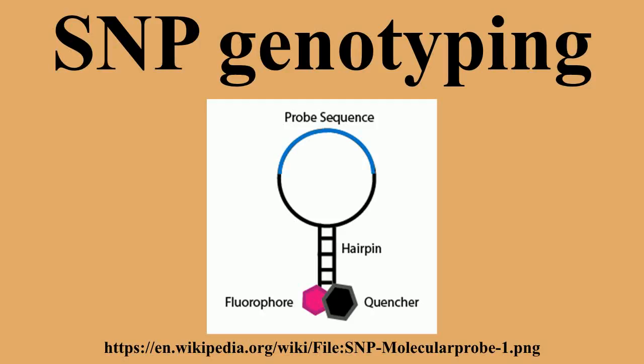If the allele-specific probe is not perfectly complementary, it will have a lower melting temperature and not bind as efficiently. This prevents the nuclease from acting on the probe. Since the TaqMan assay is based on PCR, it is relatively simple to implement. The TaqMan assay can be multiplexed by combining the detection of up to 7 SNPs in one reaction. However, since each SNP requires a distinct probe, the TaqMan assay is limited by how close the SNPs can be situated. The scale of the assay can be drastically increased by performing many simultaneous reactions in microtiter plates. Generally, TaqMan is limited to applications that involve interrogating a small number of SNPs since optimal probes and reaction conditions must be designed for each SNP.